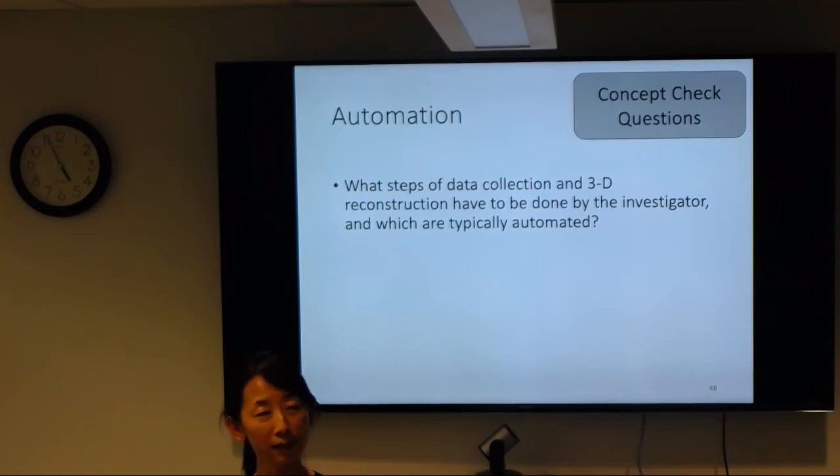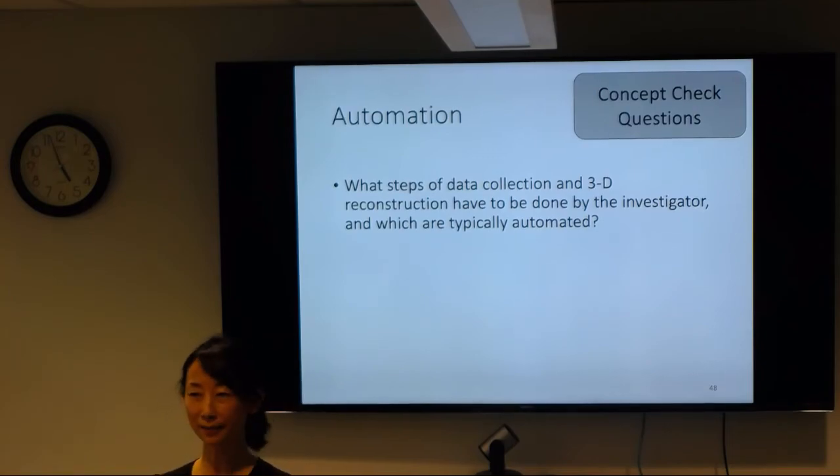But in my dream, what I want is I have the sample ready. I'm okay to prepare the sample to make the grid perfect. I want everything to be automatic once I pass that to a machine. And then I'm okay to take it out of the plunger to the microscope. I want the output from the microscope to be tomograms, and then I will enjoy my life preparing the sample, doing the transfer, picking out my area, and then doing data analysis. I think that's ideally what I want.